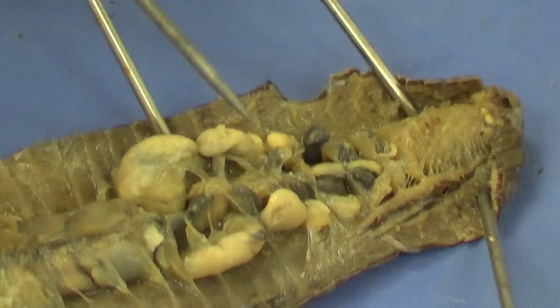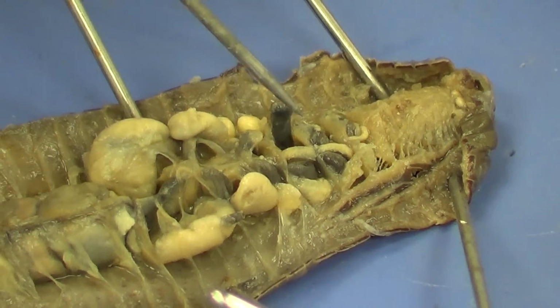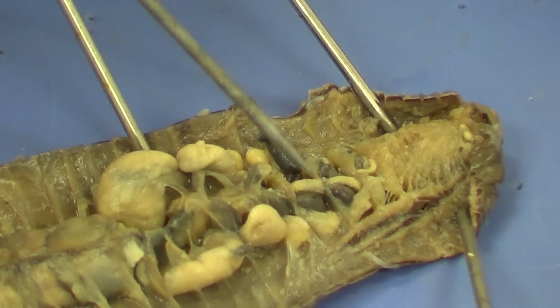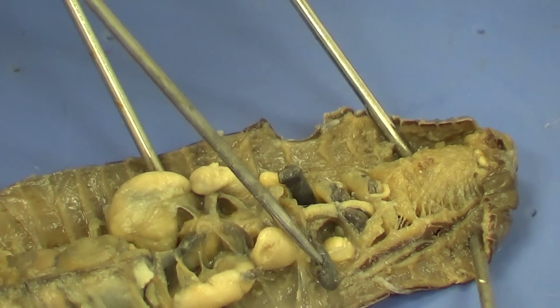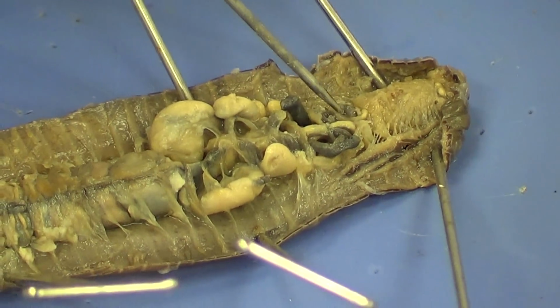If we can zoom in on that right there, that is a very nice aortic arch. That's a very nice heart. That's about as good as it's going to get. You can see one on the other side also. If I can tease that out, there it is right there. Another very nice aortic arch. And you can see another one here, another one here.